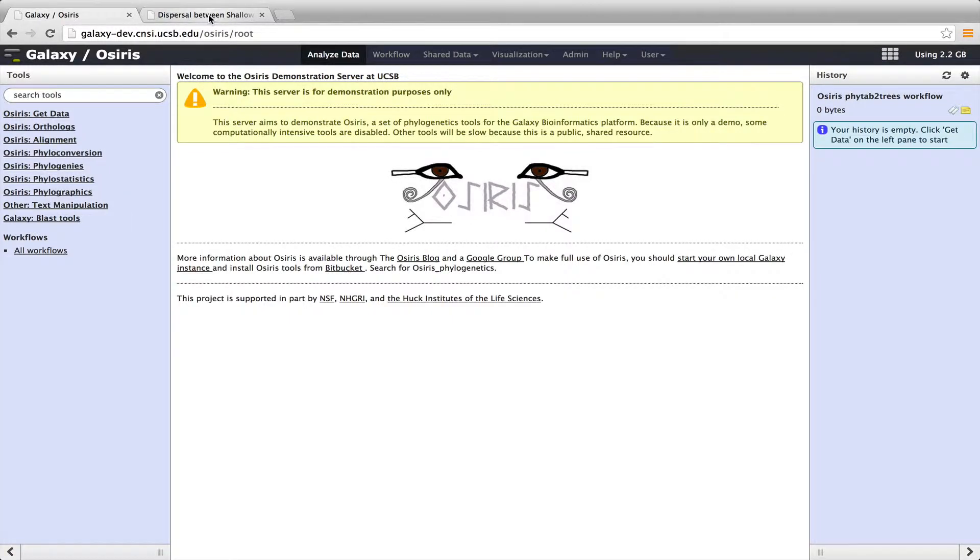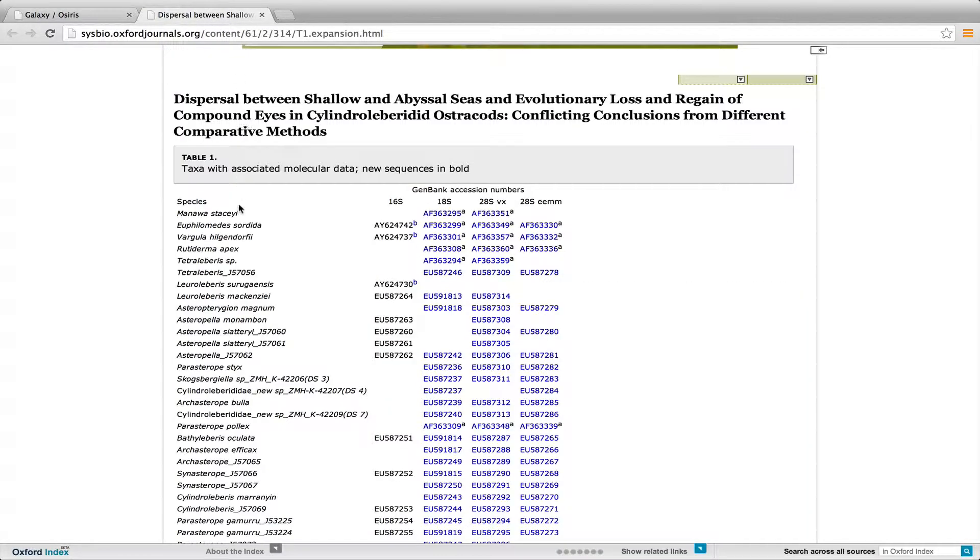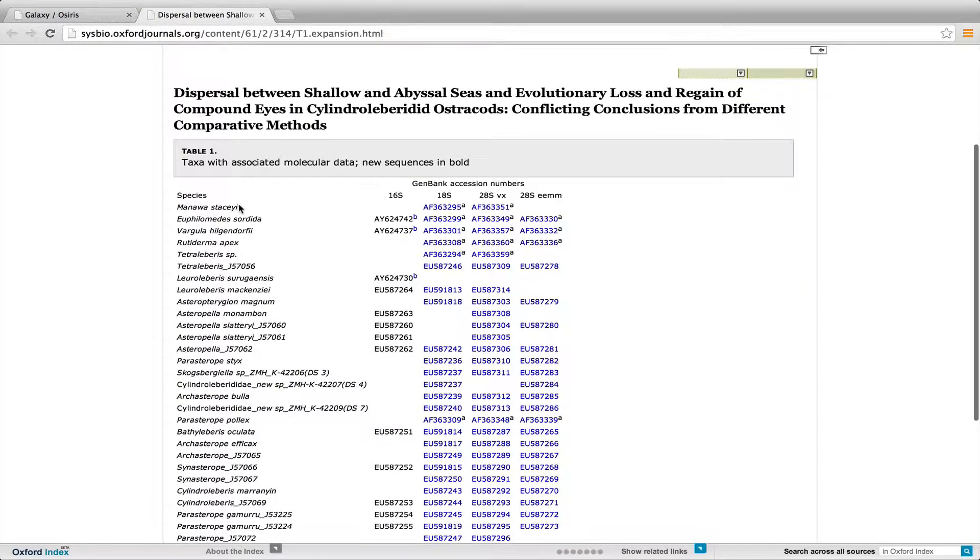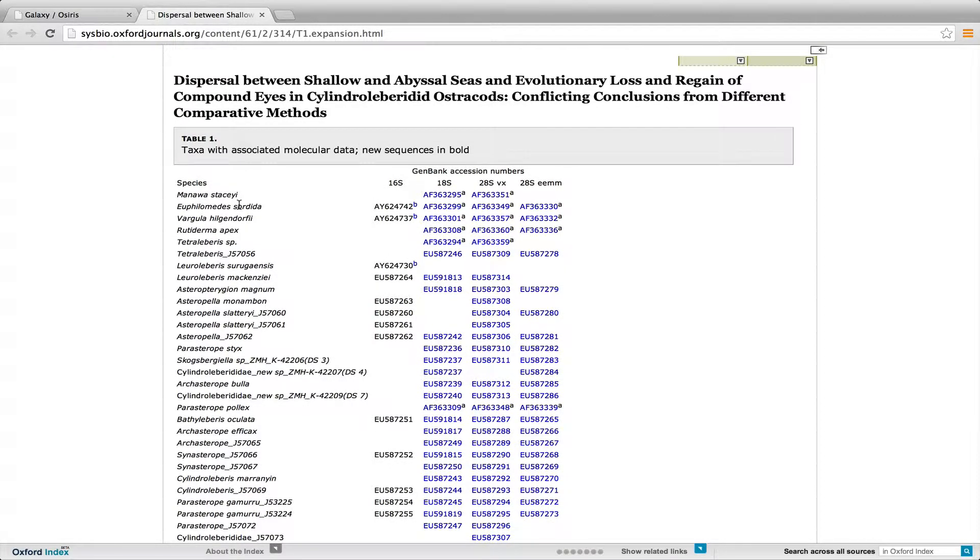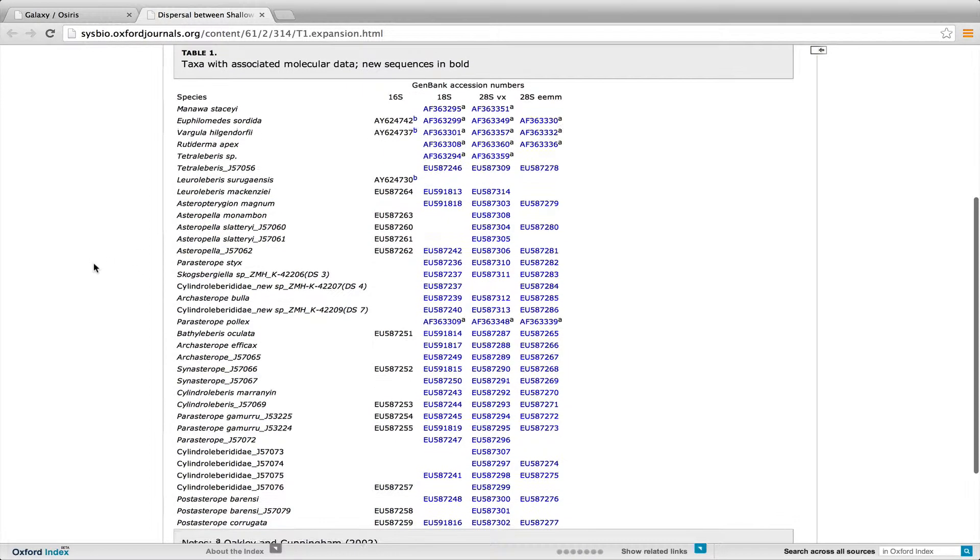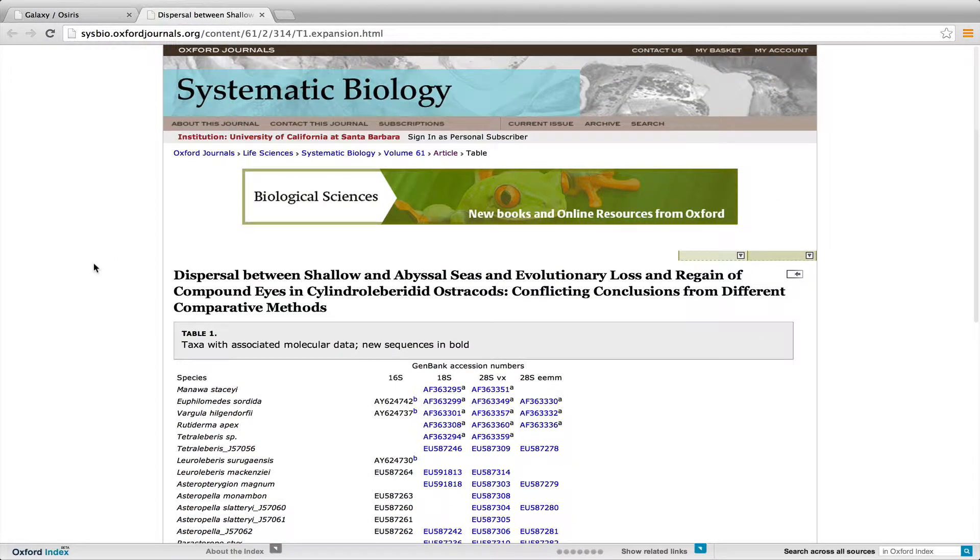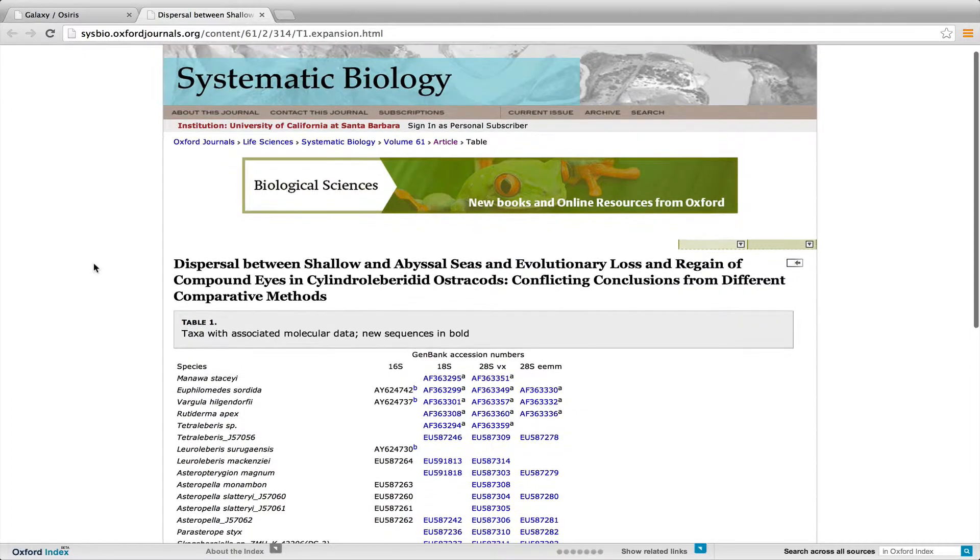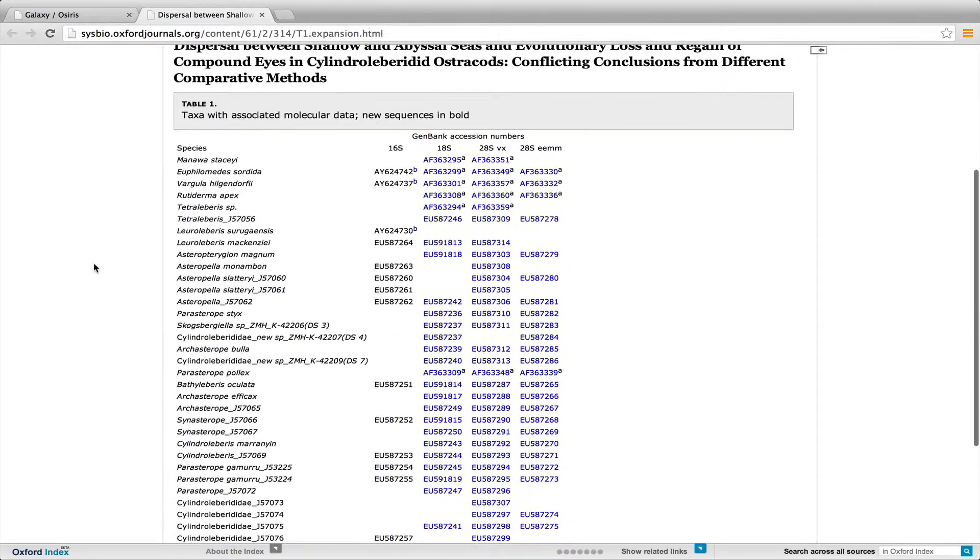So what we'll do is use data from this paper, which is called Dispersal Between Shallow and Abyssal Seas and Evolutionary Loss and Regain of Compound Eyes in Cylindraleberidid ostracods. And here's the data table. This was published in 2012 in Systematic Biology.